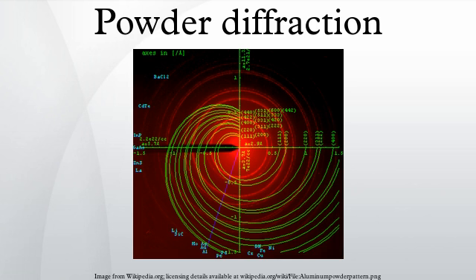Lattice parameters. The position of a diffraction peak is independent of the atomic positions within the cell and entirely determined by the size and shape of the unit cell of the crystalline phase. Each peak represents a certain lattice plane and can therefore be characterized by a Miller index. If the symmetry is high, for example cubic or hexagonal, it is usually not too hard to identify the index of each peak, even for an unknown phase.